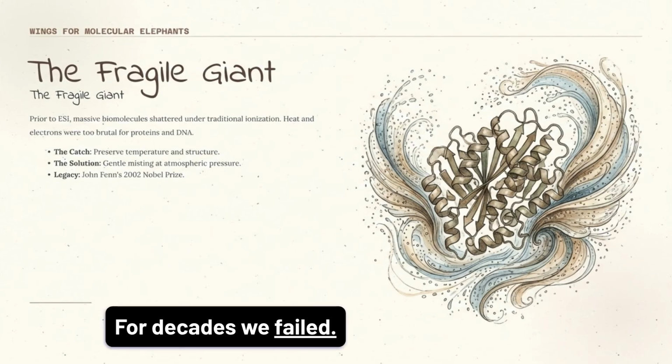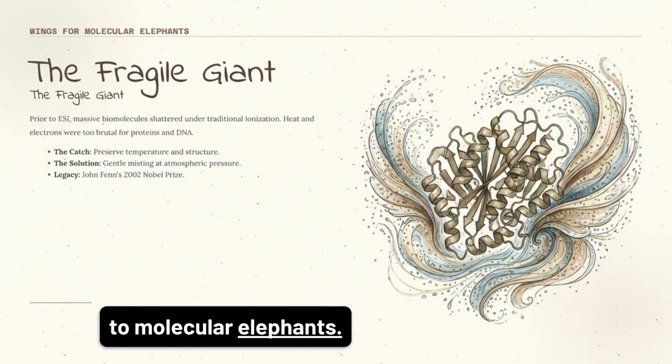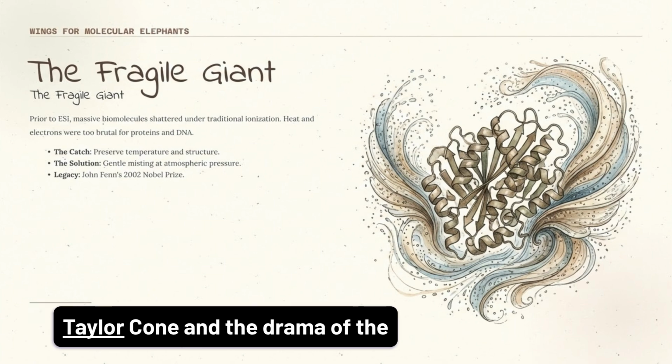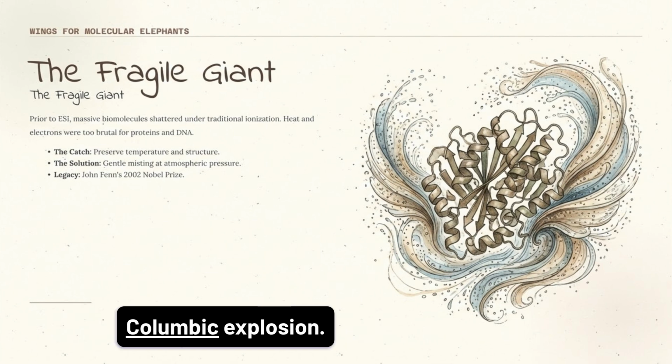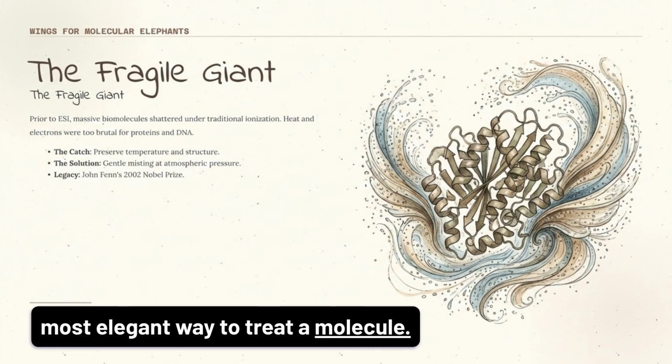For decades, we failed. We tried to blast them with heat, and they just shattered. John Fenn famously said he gave wings to molecular elephants. We are going to learn the physics of the Taylor cone and the drama of the Coulombic explosion. By the end, you'll see why this is the most elegant way to treat a molecule.